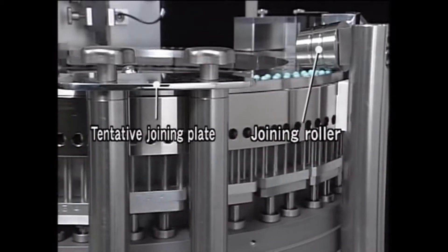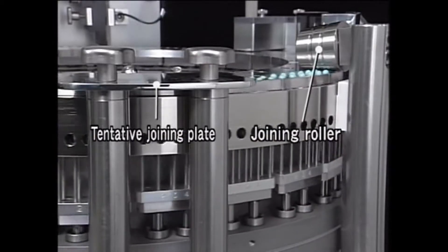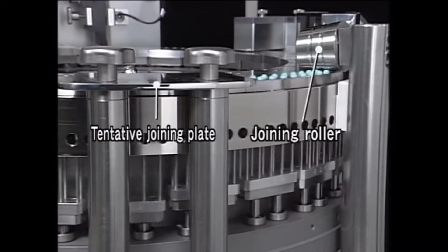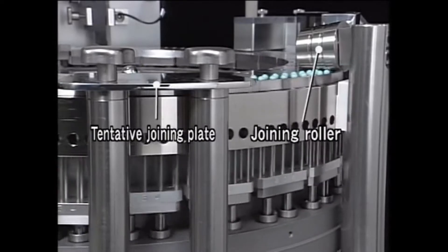After pushing up the filled body of the capsule with a plunger, the air is released from the capsule by joining the halves tentatively. This means there will be no excess pressure when introducing the mechanism for actual joining.